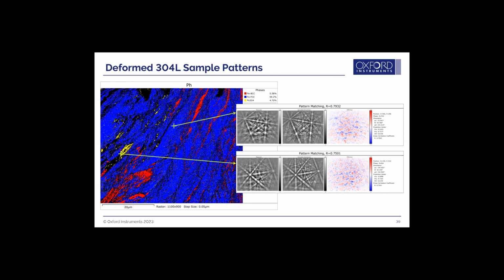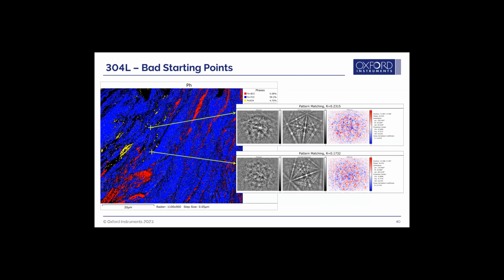Start there. Don't go crazy on the indexing sweep. If you want to use refinement sweep, again, why are you doing it is the first question. If it's to resolve some fine details, okay, great. But this one's going to solve pretty well. So DTM is certainly excessive in that case.